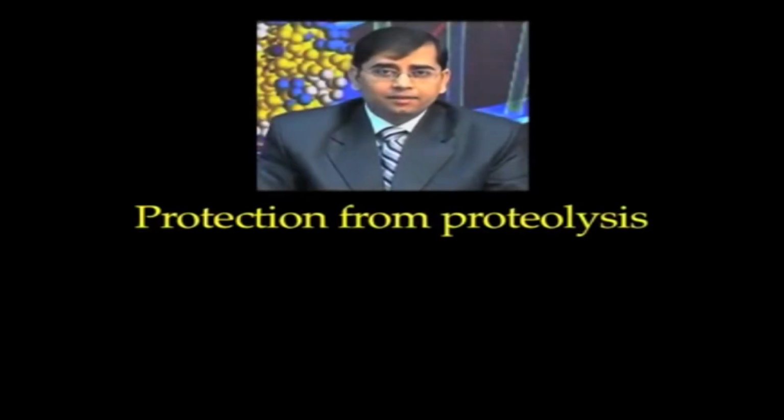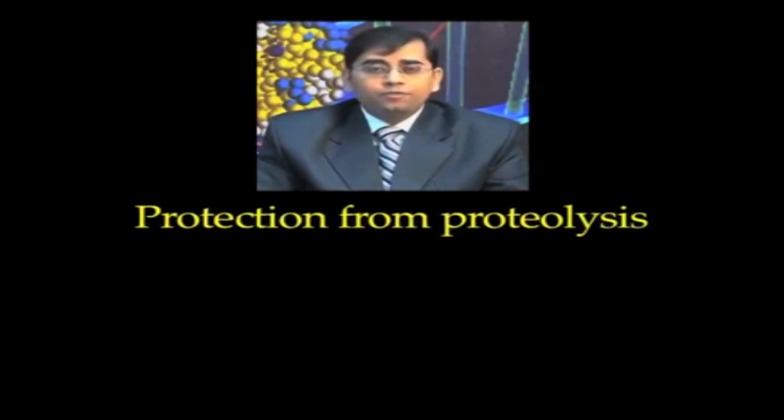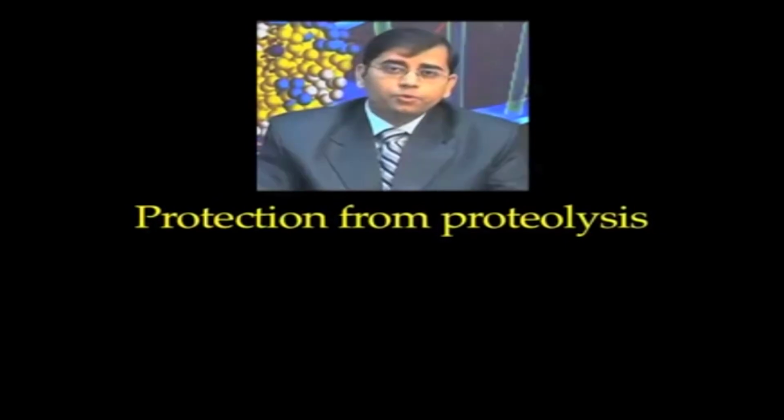Now, you have tried to break open your cells and release all the protein components and other cellular components present inside the cell. But often during this process of grinding and lysis, you may degrade some of the protein, and you need to protect your protein from the proteolytic activities of various enzymes. Protection of your protein components from proteolysis is very important during protein sample preparation.